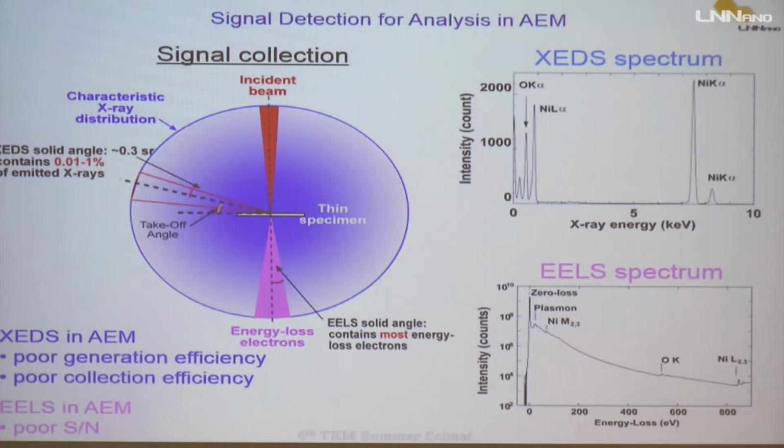It's a very complicated task, a very complicated situation, and there are many different designs. I will show something about it. But the collection of these X-ray photons is very problematic, related to the way that they are generated.